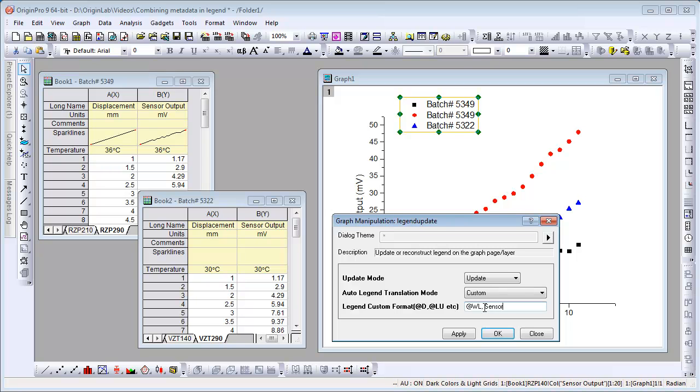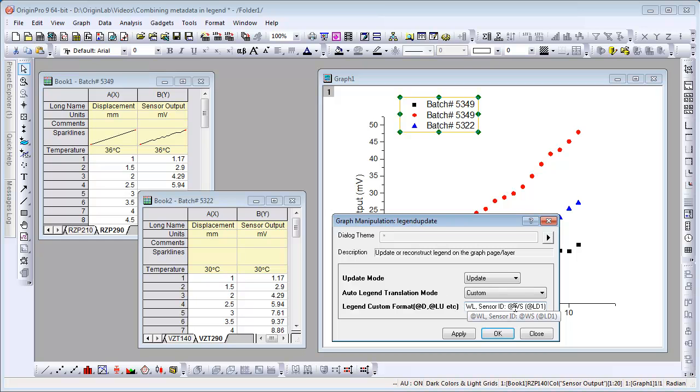We can type in here sensor ID and then more substitution notation @WS which is the worksheet name. Follow that by, we want to display the temperature value so we can pick up that user defined parameter row.